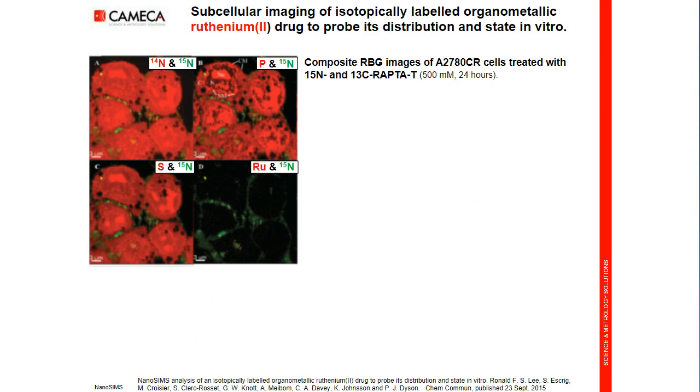One can display the images superimposed in red and green colors. So phosphorus is useful to recognize the cell compartments: nucleus, nucleolus, cytoplasm, nuclear membrane, and cell membrane.